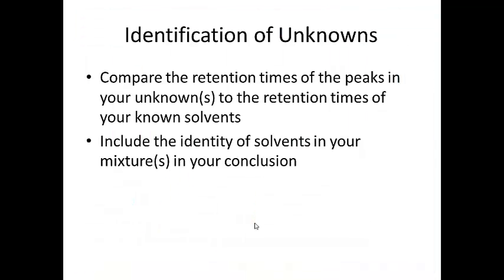So the purpose of the lab is to identify what your unknown contains. You will be comparing the retention times of the peaks in your unknowns, okay, so you'll have 2 or 3 components within your unknown, to the retention times of your known solvents and identify them. So in your conclusion, make sure you put in the identity of what you believe is in your unknown samples.